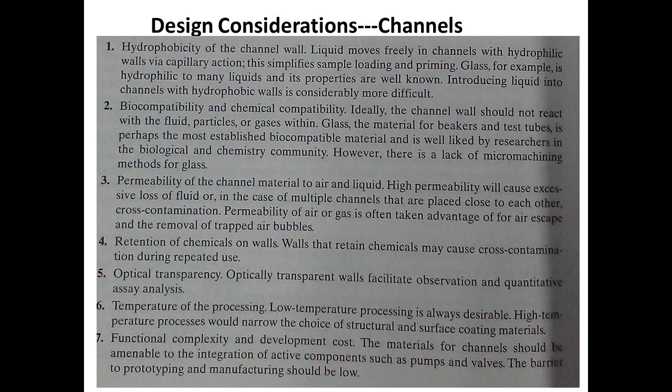Another one, the seventh point, is the functional complexity and development cost. Is it complex or not? If it is not complex, or you don't need a lot of other chemicals or hard processes to integrate active components, that will be good. And another one is that it should be cheap. If the material is expensive, that is not good.